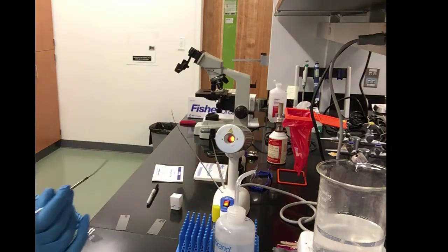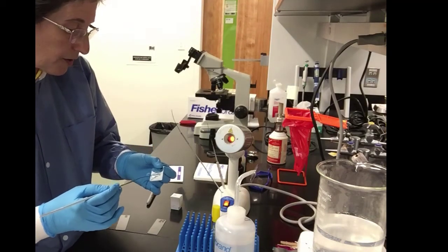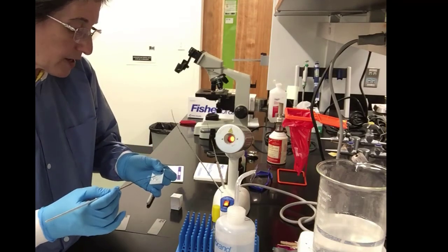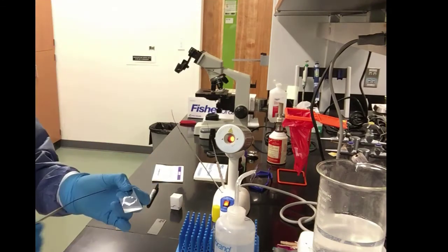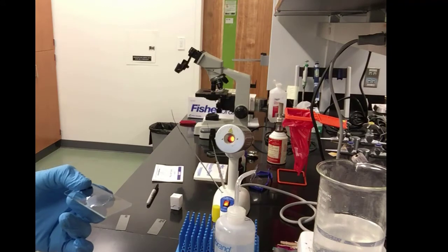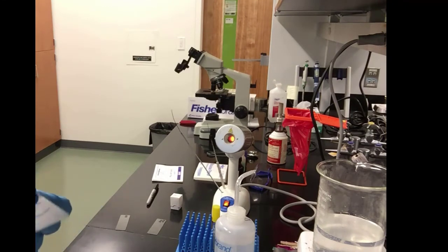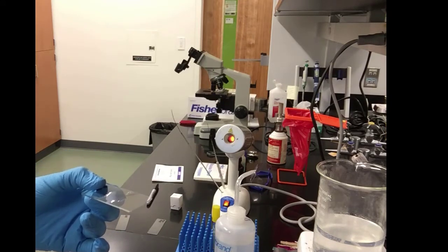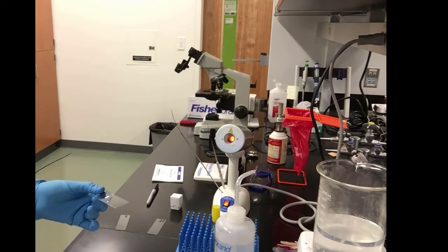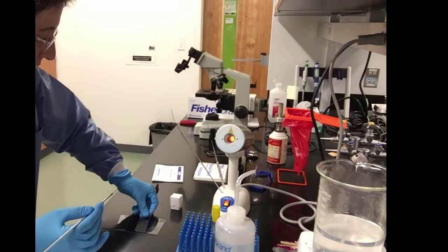We cap our staph and then we smear our staph bacteria into the drop of water, into a quarter-sized smear, if you can see here. We do the best we can. We don't want it too concentrated because it will be too thick to view under the microscope. We want to see individual staph cells. So that is the second smear that we've prepared.